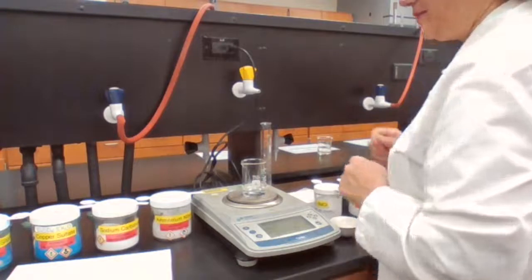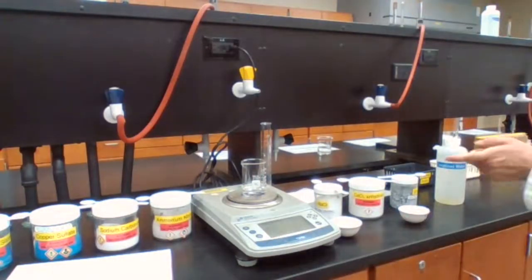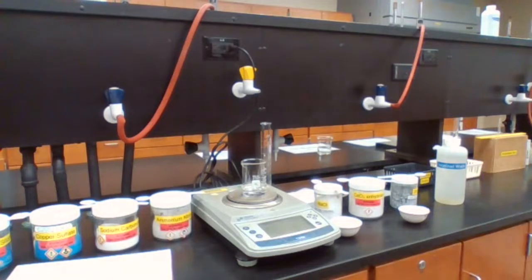Okay, let me find a dropper, and I need to take some of the water out.